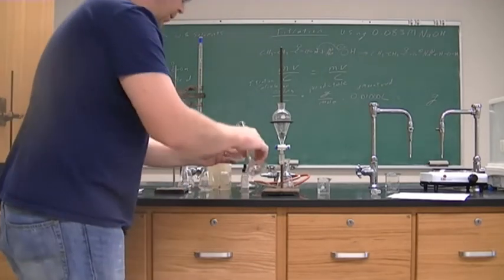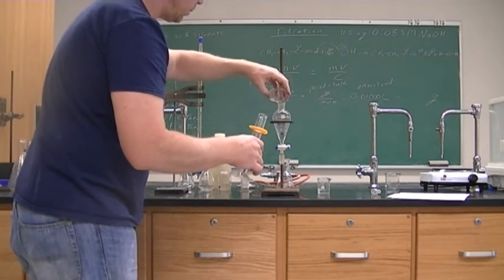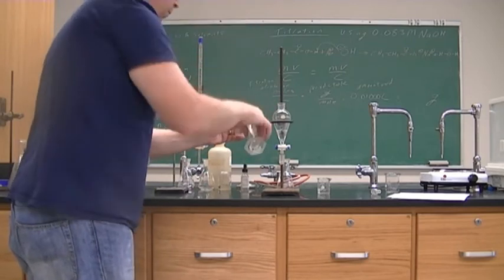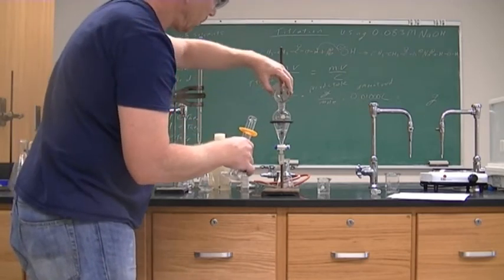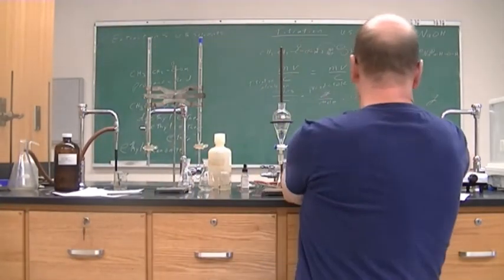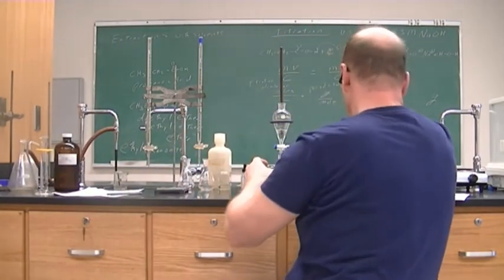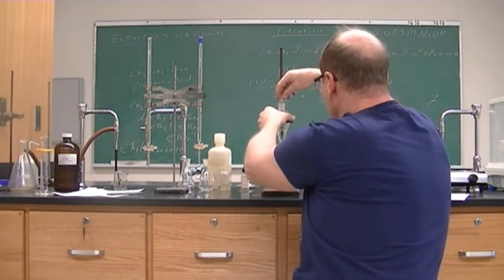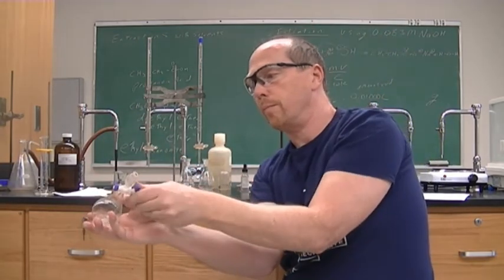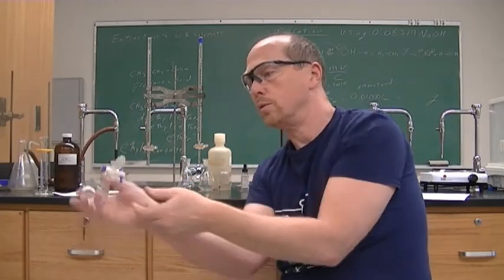So again, I want to make sure that all of it came out. Pour that in here. So it's all back in. Again, I'm putting the lid on, tilting it up, releasing the vapors, release the vapors.